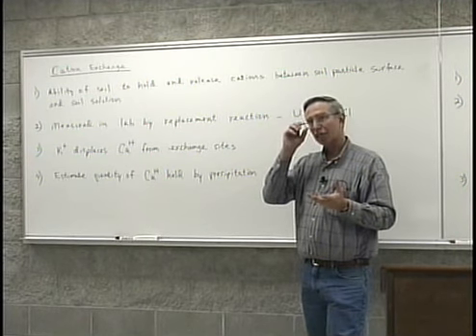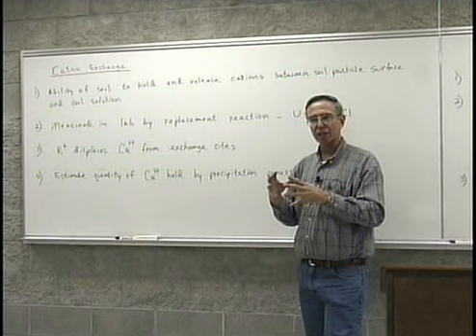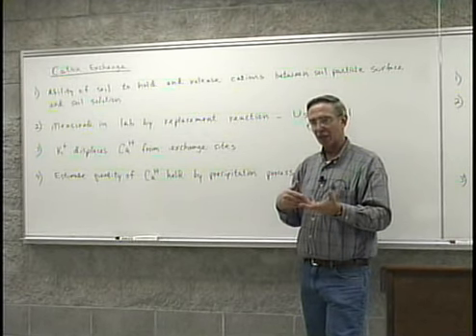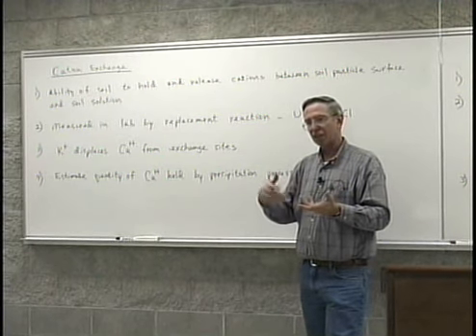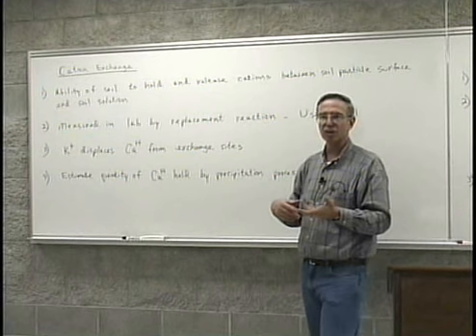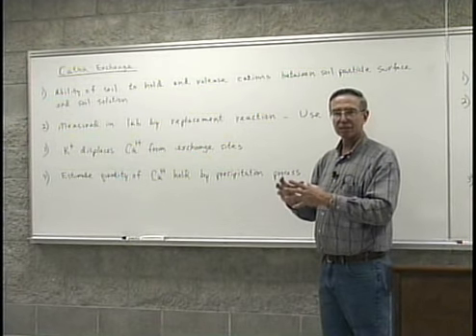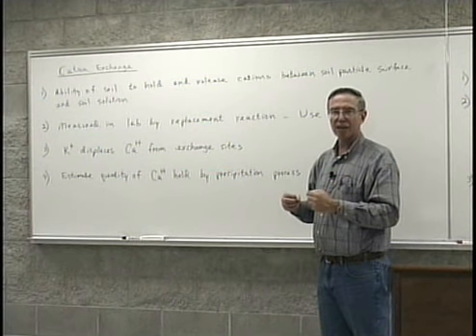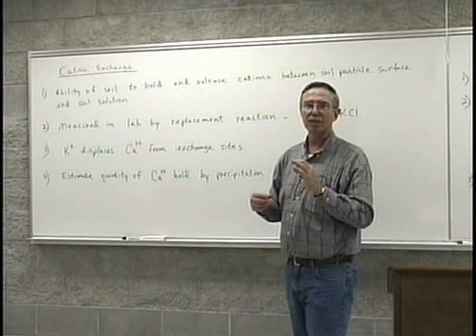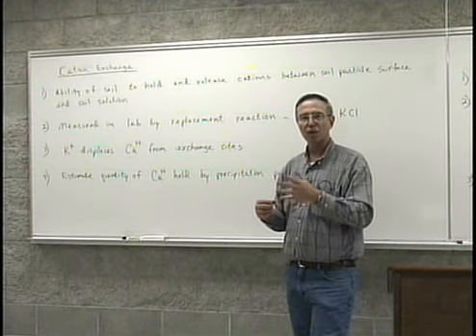Now this potassium chloride, because of its high concentration in solution in that soil, will drive off those cations that were being held on the exchange sites and replace them, of course, with potassium, the cation which is a part of this solution. We will catch the leachate from that soil sample, and then we're going to add a couple of drops of concentrated ammonium oxalate to this particular solution, or to that leachate.